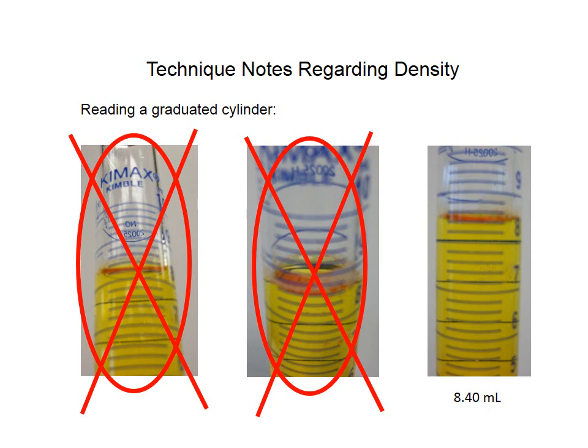That 0, you're going to say to me that 0 doesn't matter because it doesn't make any difference in my calculator. That's true, but you write it down so that somebody knows that you're using a device that was marked off this well to make that decision about what that digit was. This is where your idea of significant figures comes into play. It's important for the final results you get in any kind of experiment to know how precisely you're able to know that value.